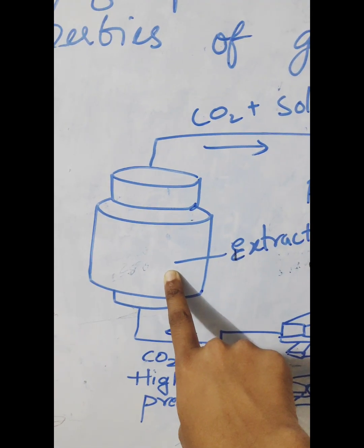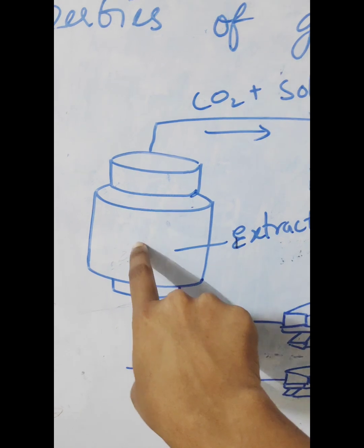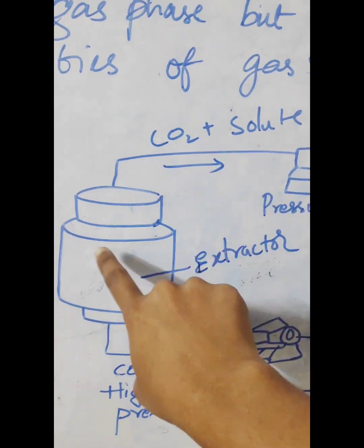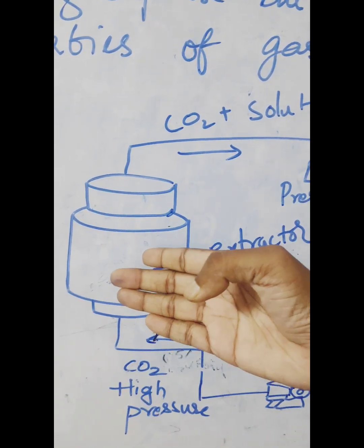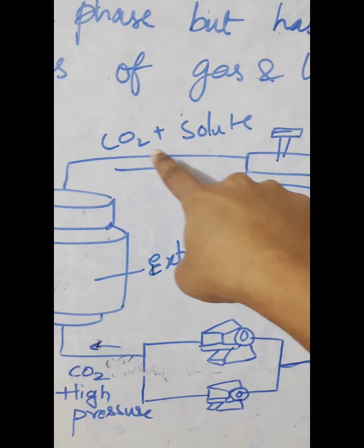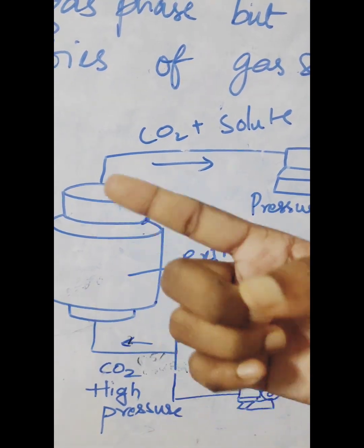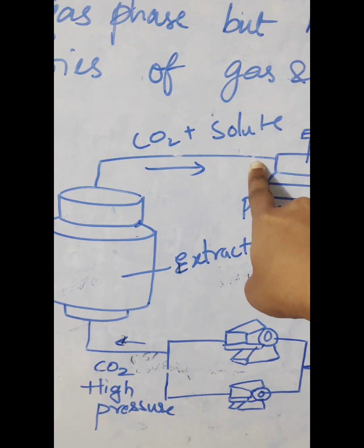From the extractor, the extraction has happened. Now the carbon dioxide along with the solute, whatever compounds have been extracted, will be moving along here.